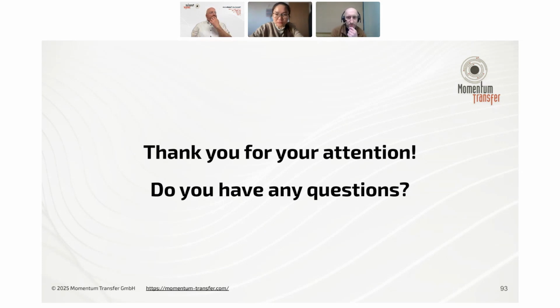Maybe can you talk about time resolution in terms of what is the exposure time we have usually? Well, in our case, the exposure time is not so relevant. We just measure to get good statistics on the data. We're not doing in situ measurements. So there's nothing from our measurements that's going to give you time resolution in that sense.